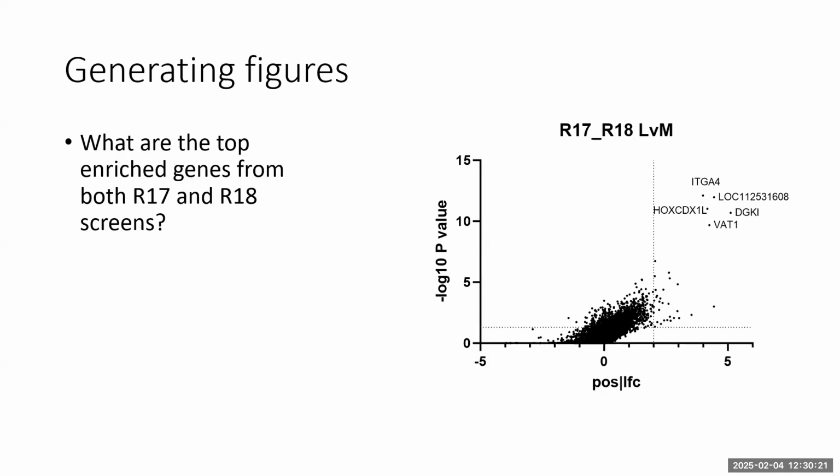I think the genome-wide screens are nice. They do tend to pick out specific things that are heavily biased, so entry factors, anything that gives a really big phenotype. What I would like to do next is be more functionally specific, maybe with smaller libraries. It all depends on the readout. If you have a readout that works for high throughput, that's really what you need. Some of the things we're looking at doing is treating cells with interferon, then doing the viral infection, which adds an extra layer of complexity. But if you can generate, say, a fluorescent readout for whatever you're interested in, then you can measure that.